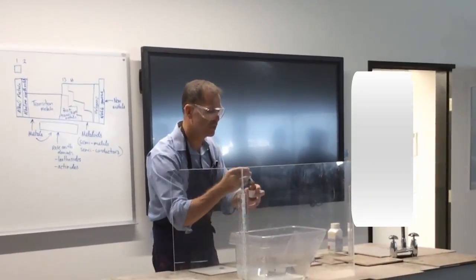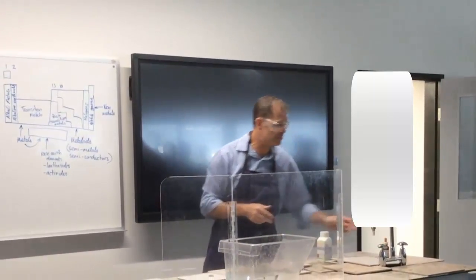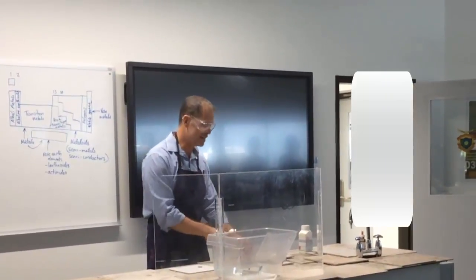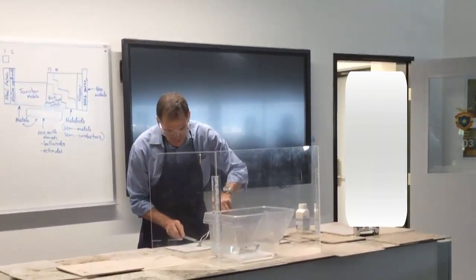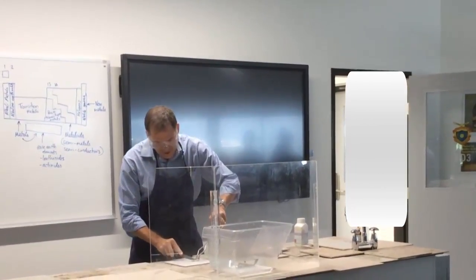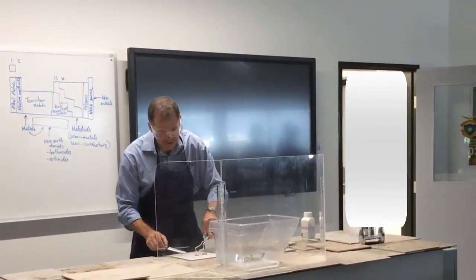Put a bit more in there. What's going to happen is when this reaction occurs, you will see the phenolphthalein go pink, because that'll indicate there's a chemical reaction going on and there's an alkali, or a base, being formed. Okay, so let's get a little bit of this, and without any more talking. We'll try that size first and see how we go — I think that'll be quite sufficient.